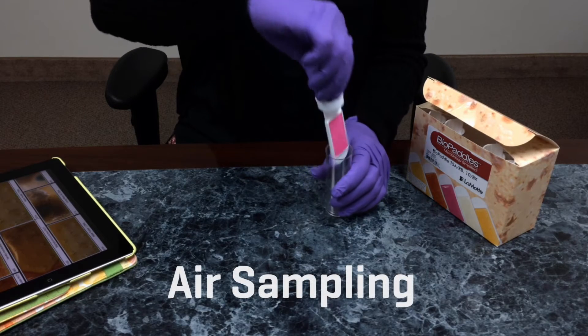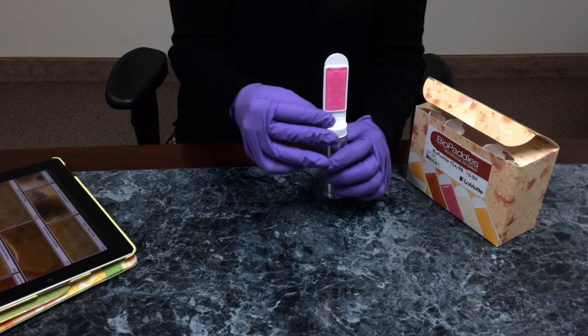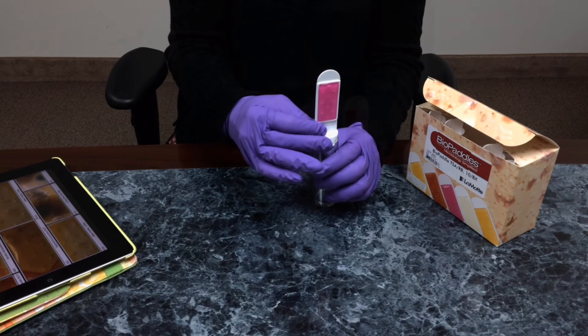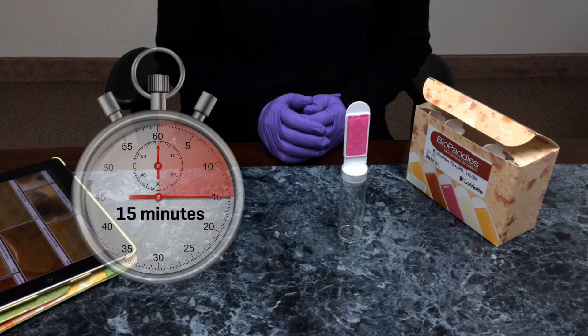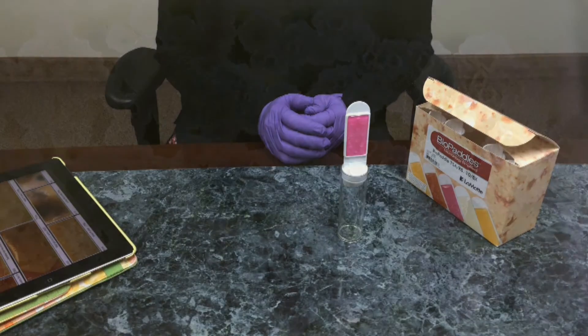Bio paddles may also be used to sample air. Remove the paddle from the vial, invert the paddle, and insert the cap into the vial to expose the agar to the air. Expose for 15 minutes, then reinsert the paddle and incubate following directions.